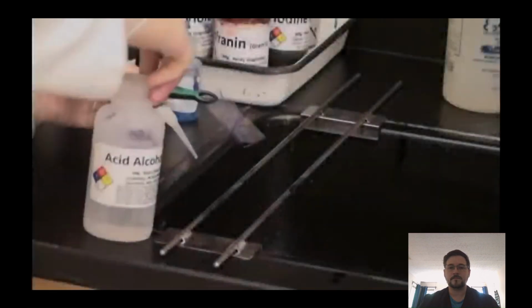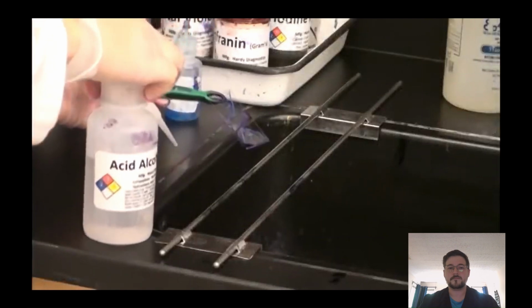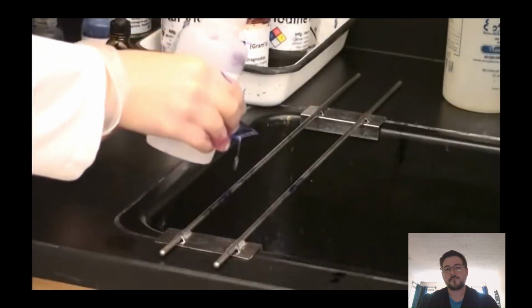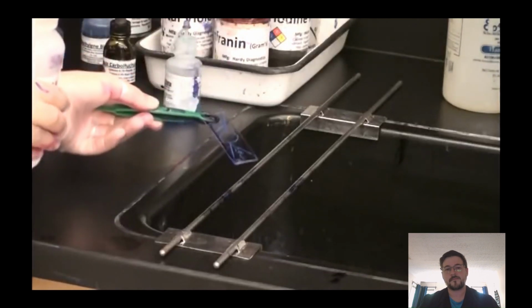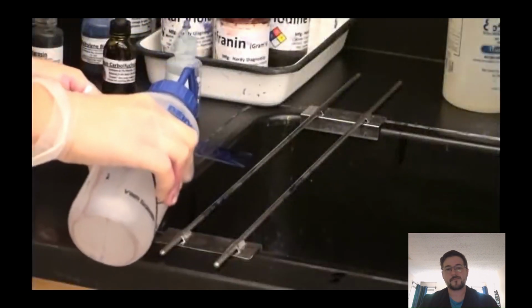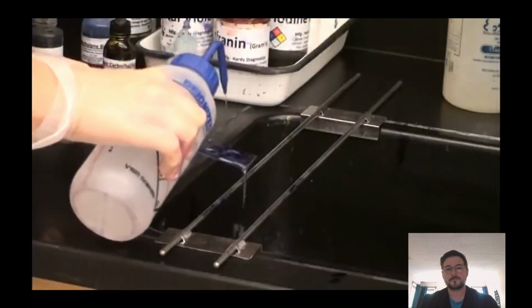Decolorize the smear by flooding the slide with acid alcohol. Flood the slide with acid alcohol, wait 30 seconds, tilt, repeat this procedure for a total of 2 minutes. Rinse the slide with deionized water, shake the excess water from the slide.